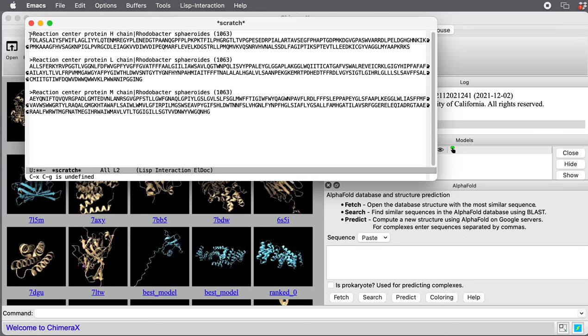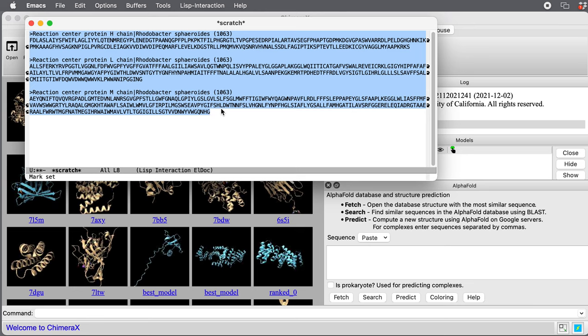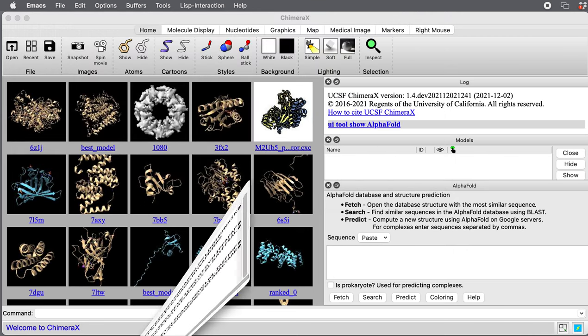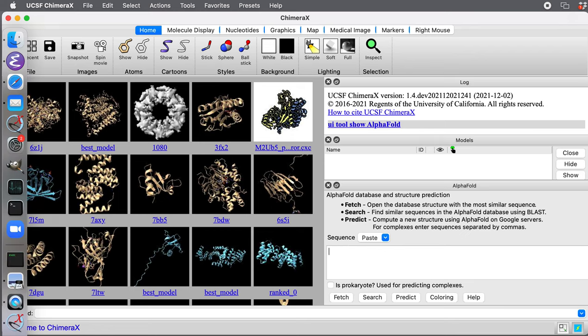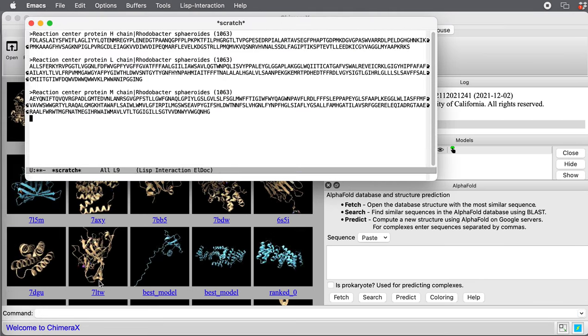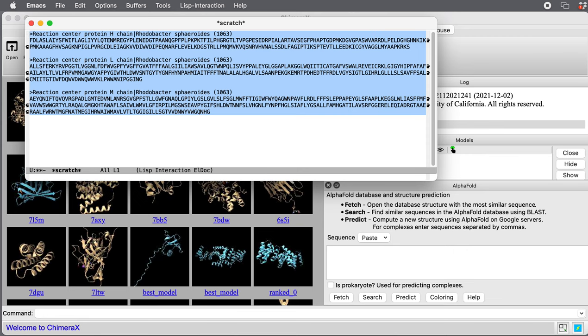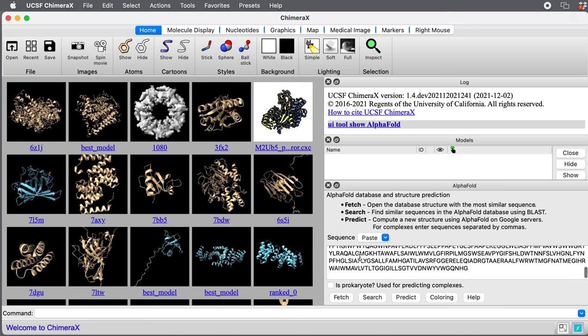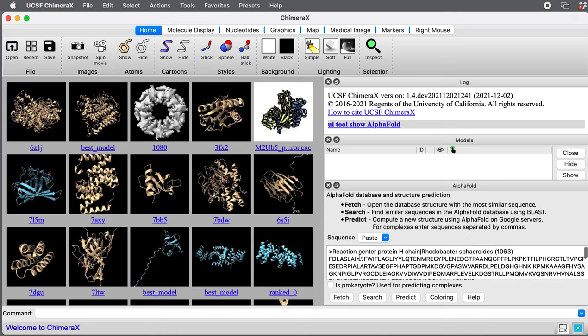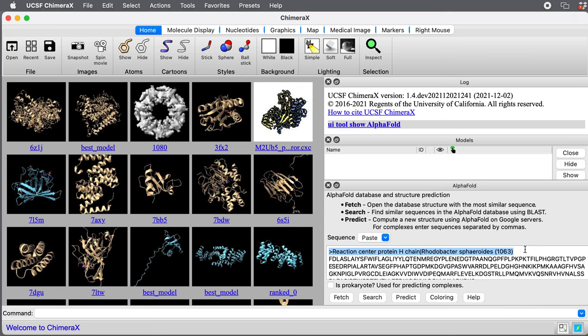I'm going to cut and paste the three sequences. I had it as a FASTA file here. This looks like a FASTA file with some header lines. Those should not appear in this box, only the sequences. So I'm going to delete those.